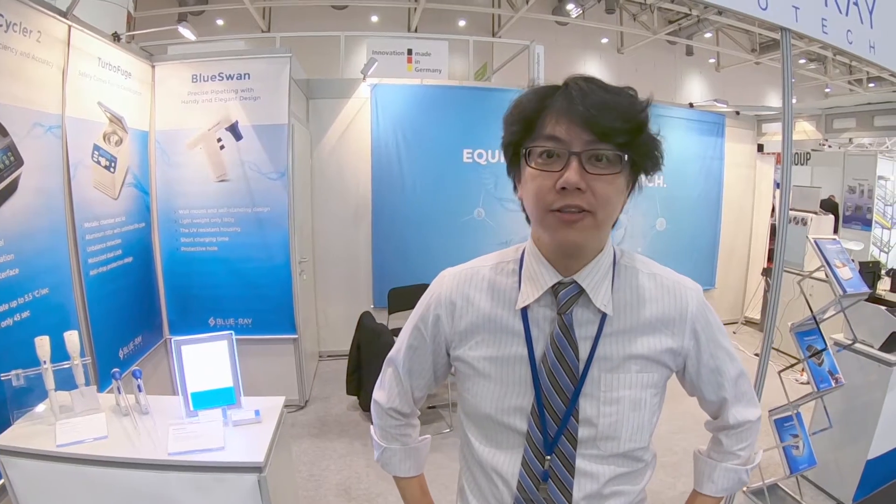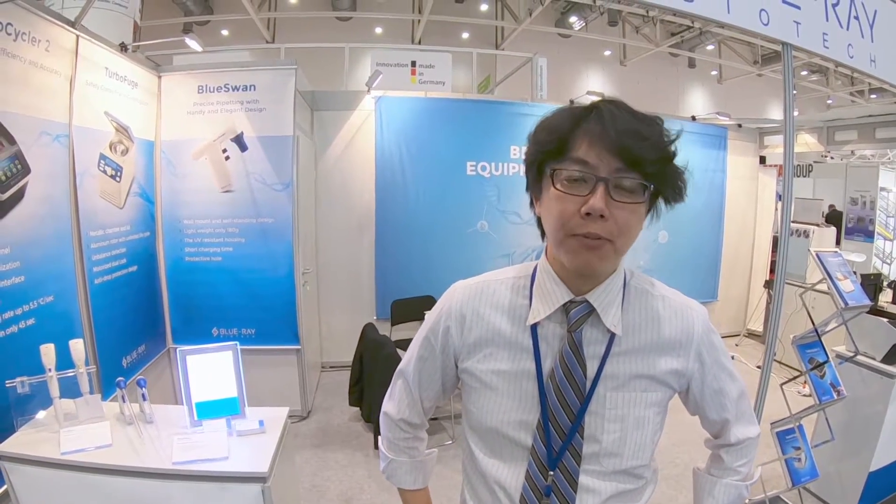Welcome to BlueRay Biotech at Revolution 2019. My name is Tony Chen, I'm the sales manager of BlueRay. We come from Taiwan and we are keen to provide high quality and reliable lab equipment on the market.